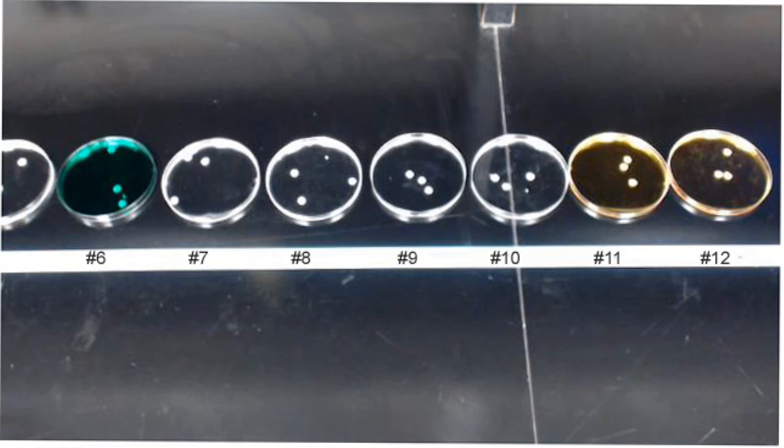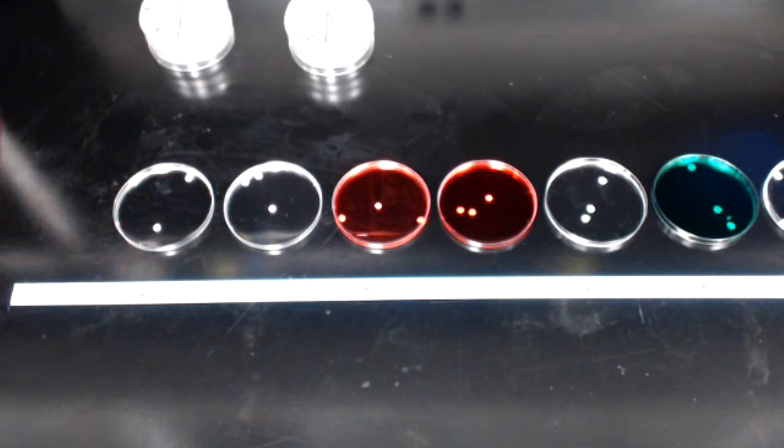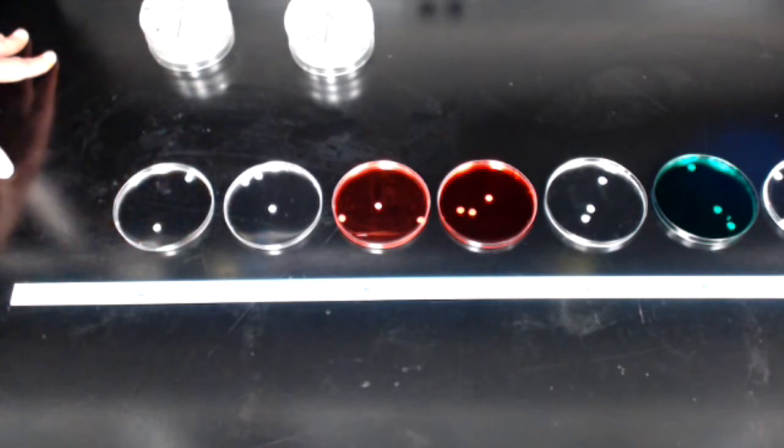I took the 3 plates labeled E. coli and I swabbed the surface of each of those 3 plates from a broth of E. coli. The 3 plates labeled Staph aureus, I swabbed the surfaces of those plates using a broth of Staphylococcus aureus. The other thing I did was I took each plate and divided it into quadrants.